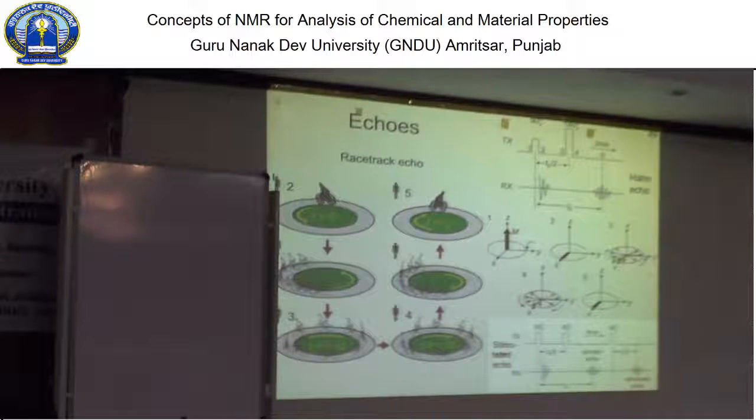And there is the physics. It's the molecular motion. That's the physics. And that is impacted by all kinds of things. You know, molecules sit in a small pore, they can move less freely than in a large pore. So pore size you can measure in terms of diffusion, which we'll address later, by similar measurements that basically affect the magnetization decay and gives you pore size distributions which you can nicely determine by NMR.